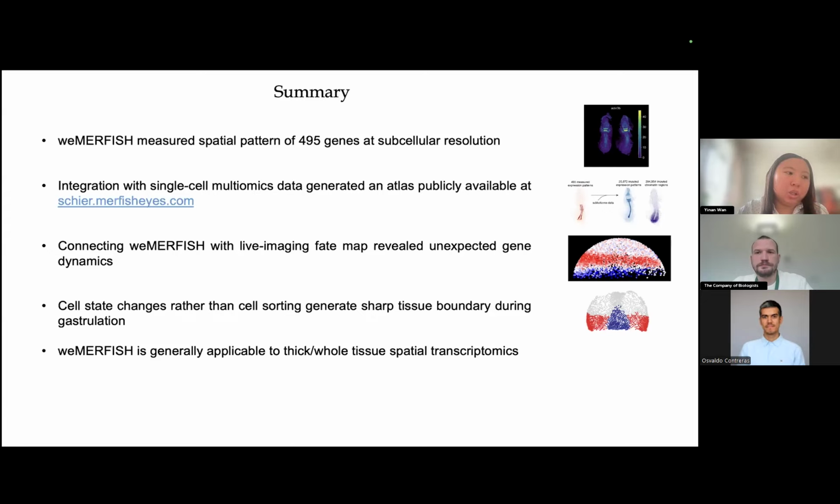We did try a couple of other methods. For example, there are ways where you can input the location of the transcripts, and based on co-expression of genes in the superpixels, it can resegment your data based on similarity. Unfortunately, we're not super happy with the results because it gives us too many small segments. So we tried our best to segment the cells while reporting what we believe is the actual real number of the cells in a dataset. Great, thank you for your answer.